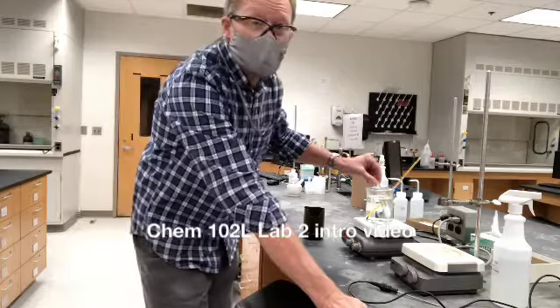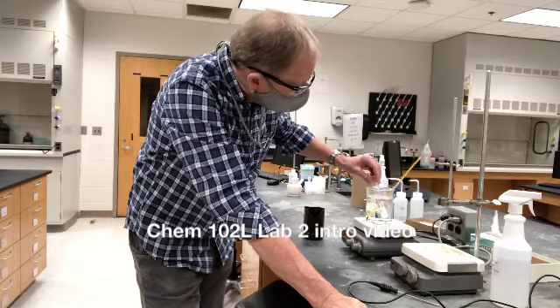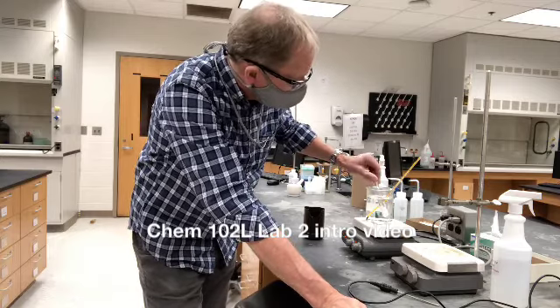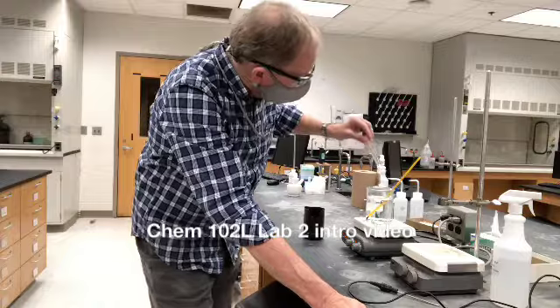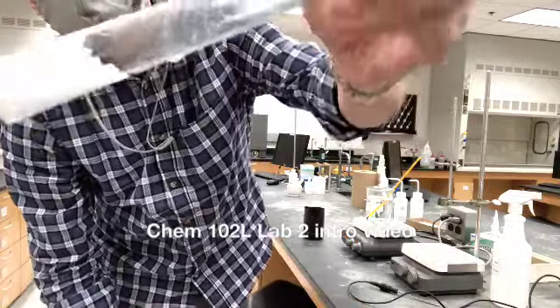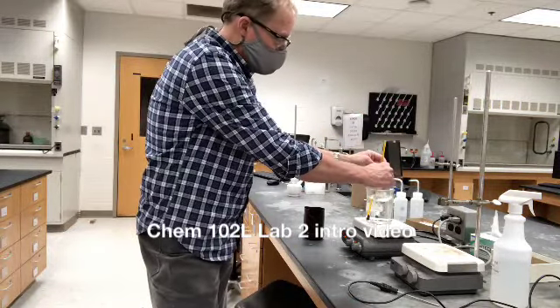So I showed you that it's a powder, but it does have a melting point that is not terribly high. You're going to measure it in the lab. And you can see this water that's a little above 60 degrees is enough to melt the sample, and you can see it's already started melting. So I'm just going to let this kind of melt.